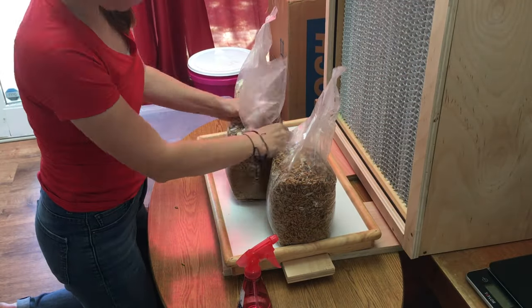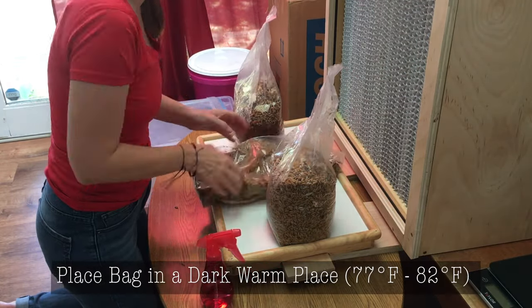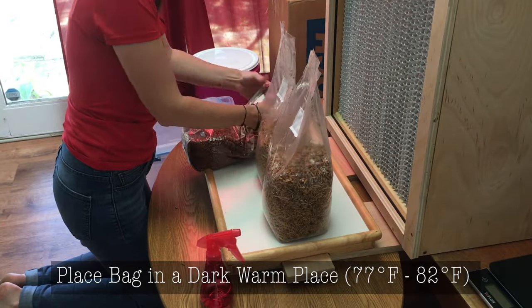Finally, set your bags in a dark, warm place for about 10 to 30 days and watch them fully colonize.